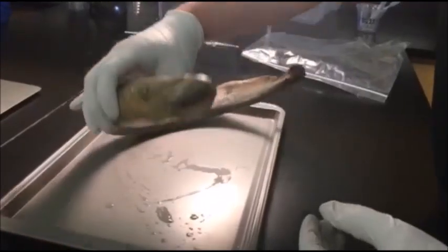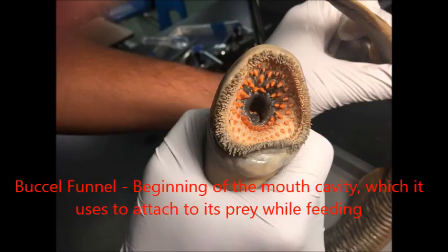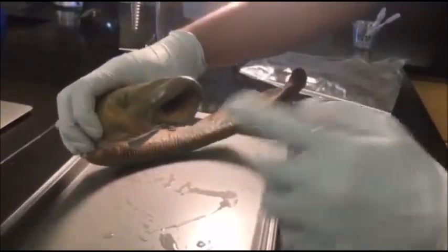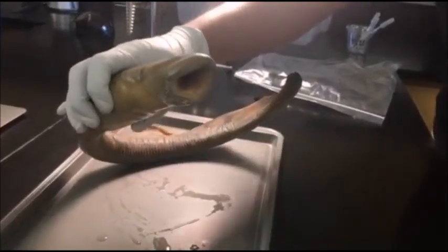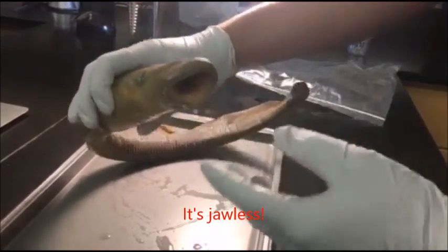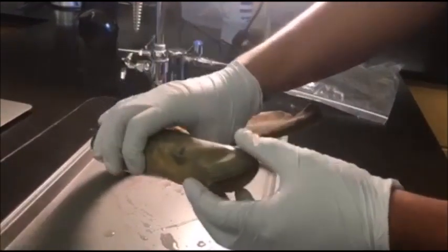This is called the buccal funnel, which is basically the beginning of the mouth cavity. The weird thing about my friend Pickle is he doesn't have a jaw, so he's one of the jawless creatures that we're all able to see.